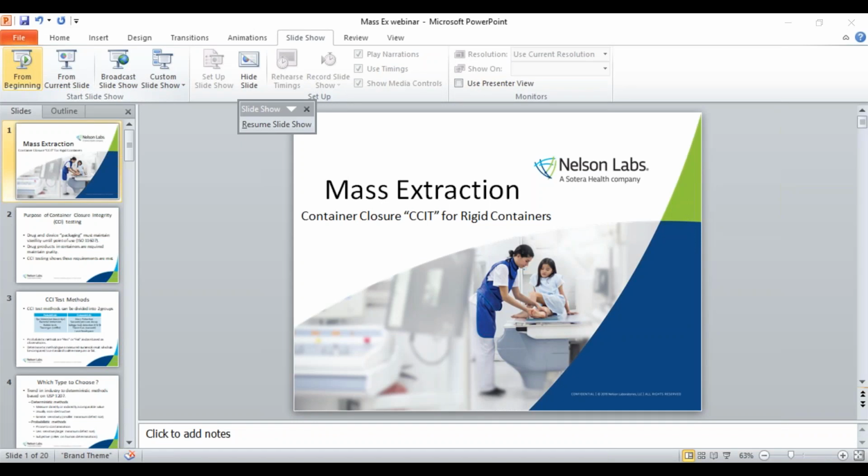In short, if it'll fit into one of our test chambers and it's a rigid sealed container, well, there's a good chance that we can test it. We'll be evaluating expanding the method in the future by adding some different chambers, maybe even a larger chamber for bottles, or we might expand into IV bags. I know IV bags aren't rigid containers, but ATC has published an article saying that it's a possibility.